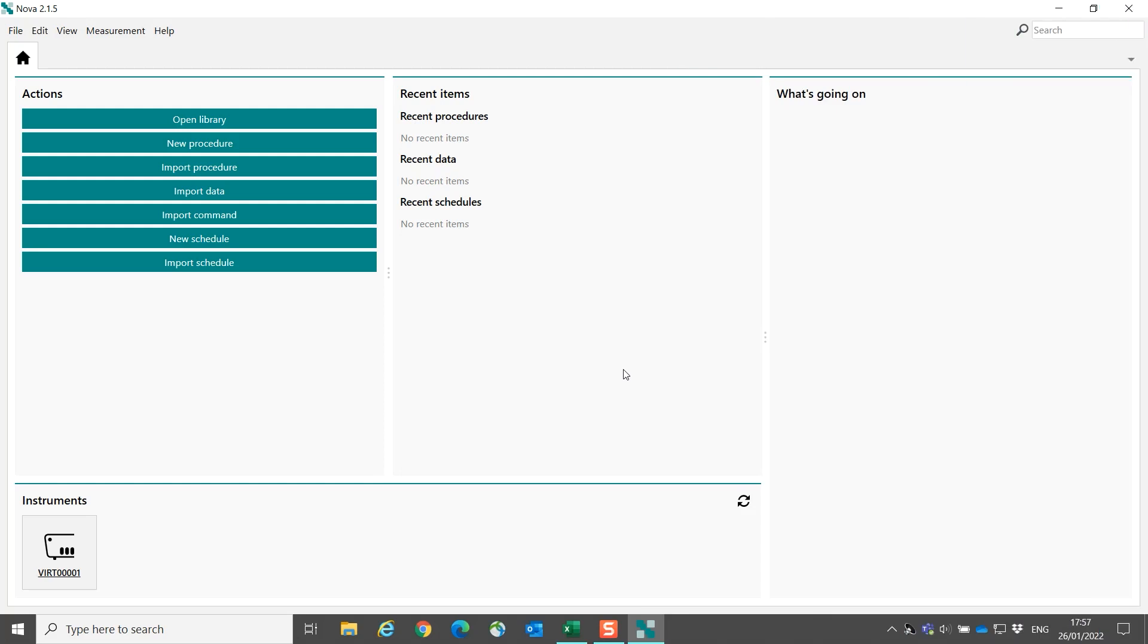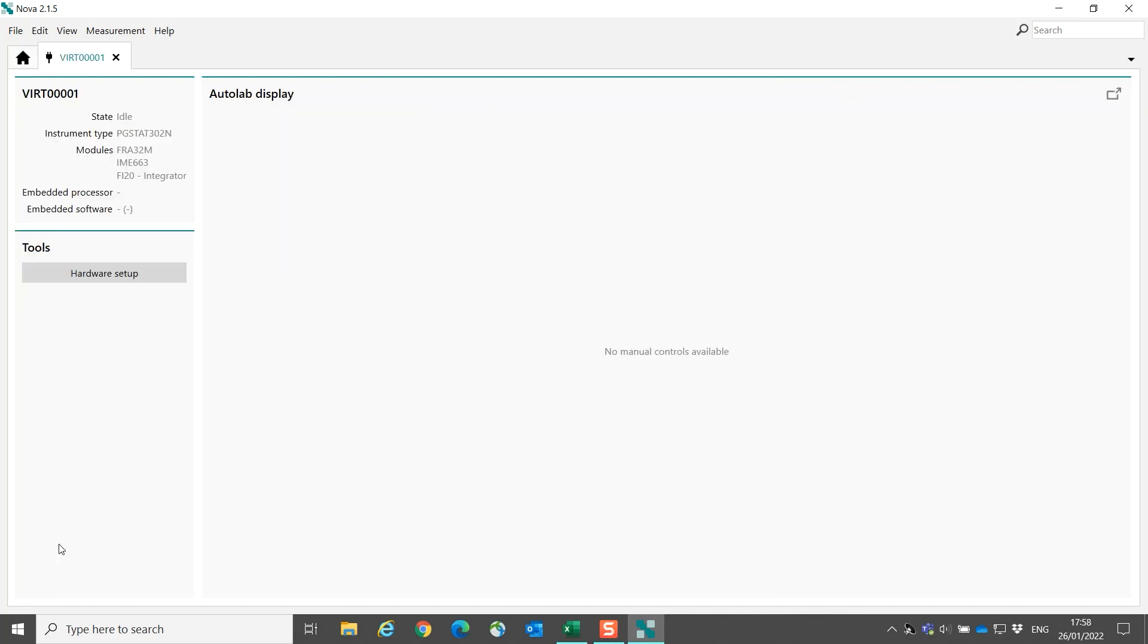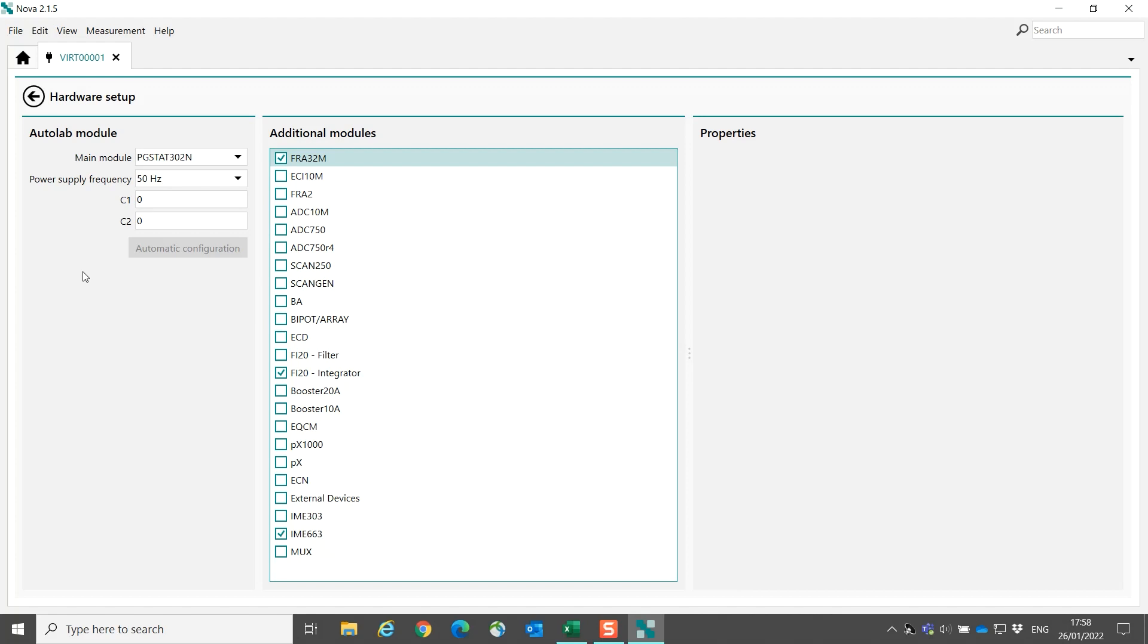To configure the rotating disk electrode in the NOVA software, we have to enable it in the hardware settings. First, we open the NOVA 2.1 software. When the software is open, you go to your instruments, and it depends what kind of instrument you have. In our example, we use the PG-Stat 204. So we go to the hardware setup and select PG-Stat 204.